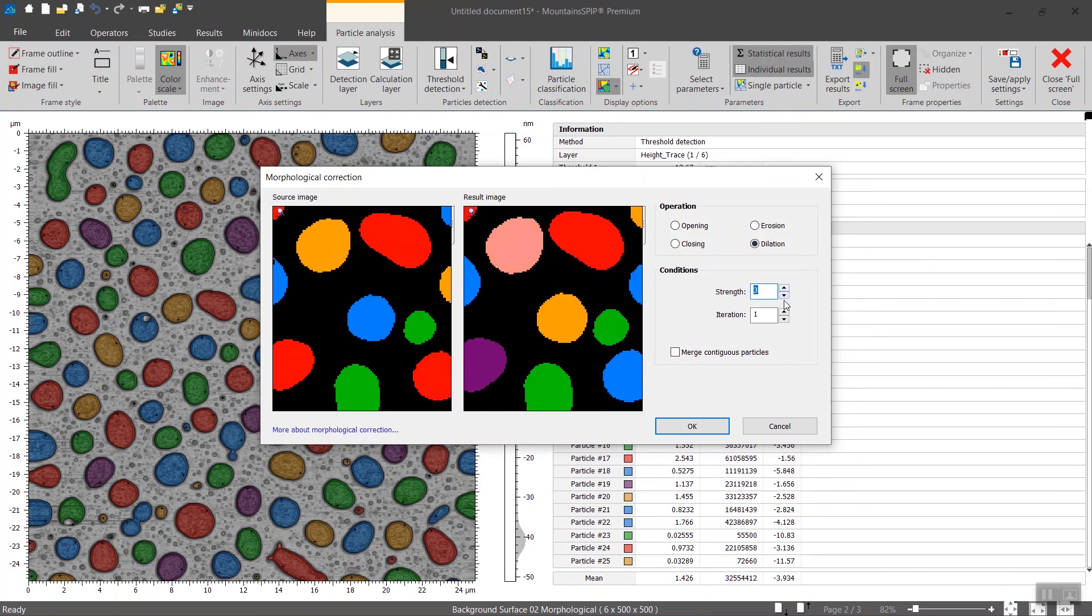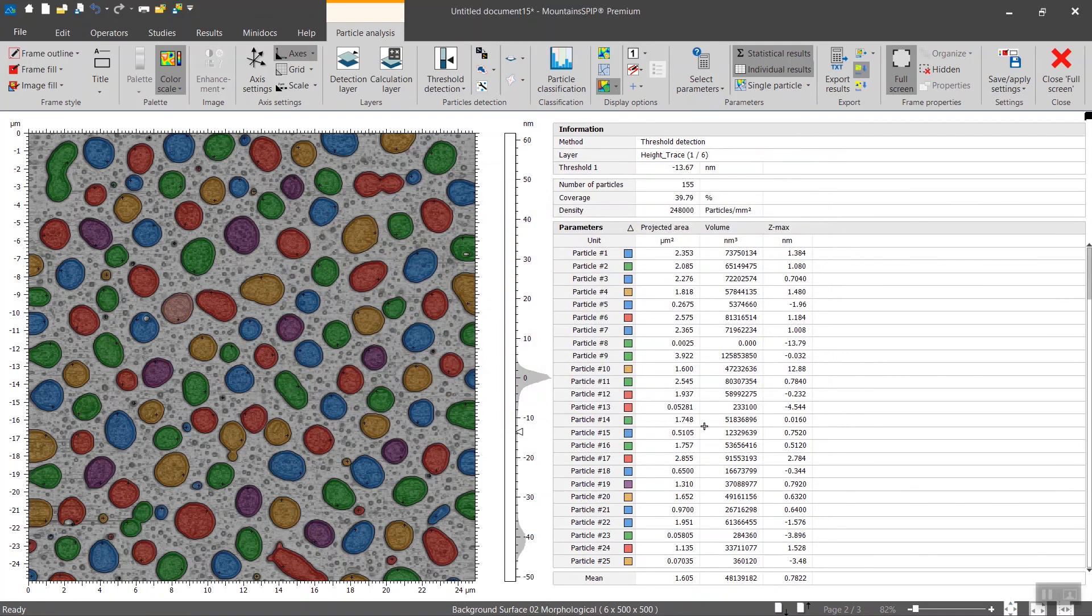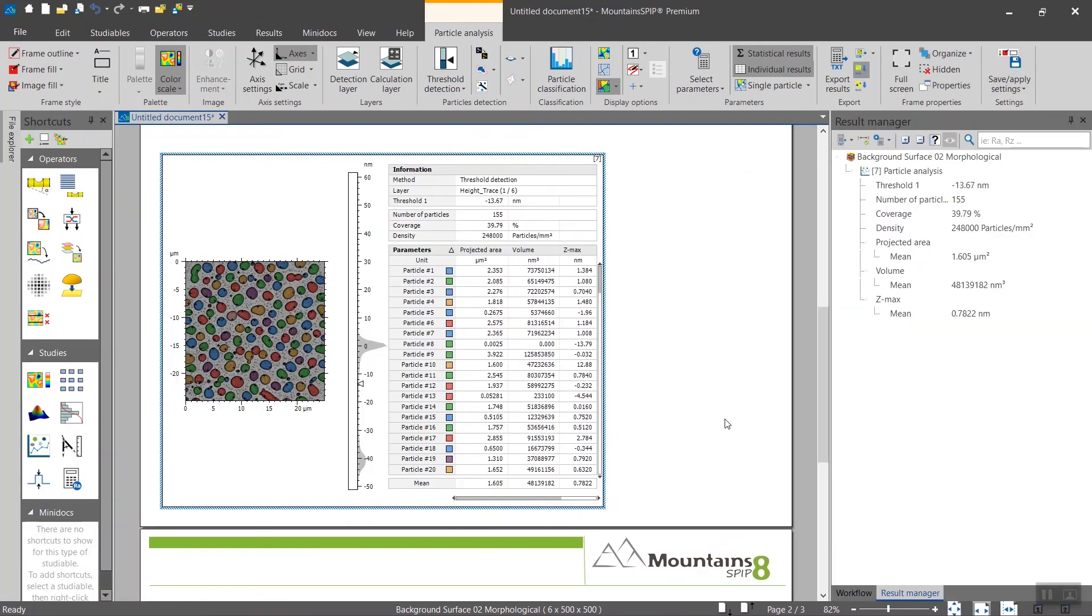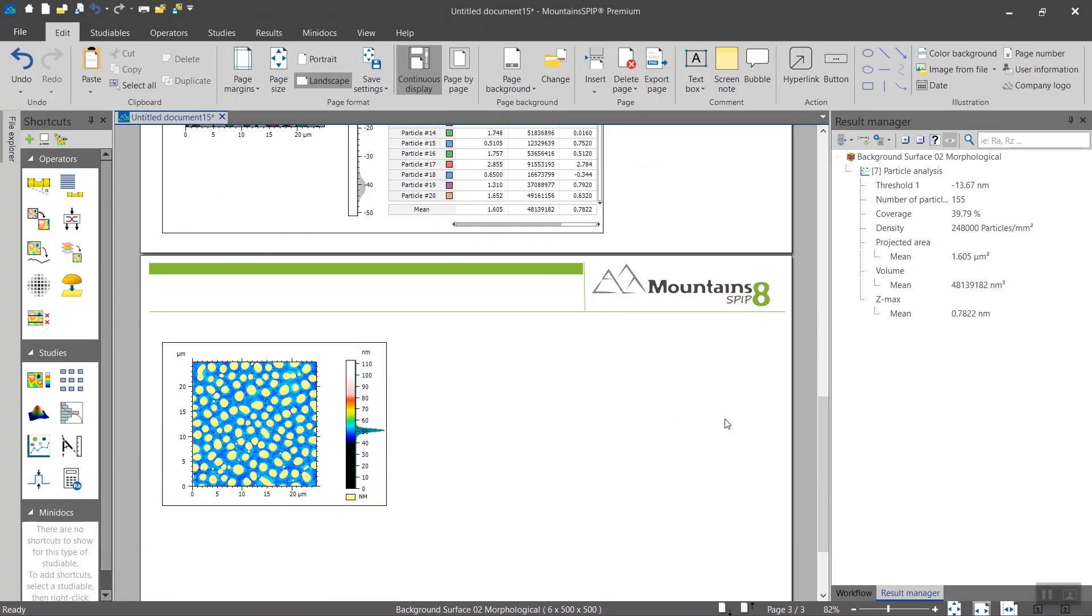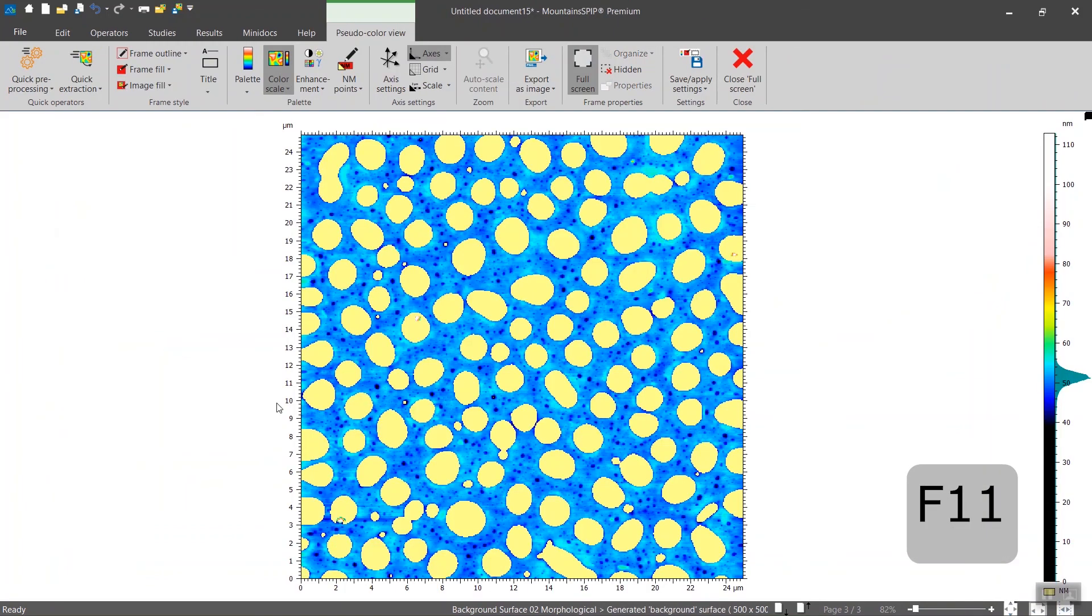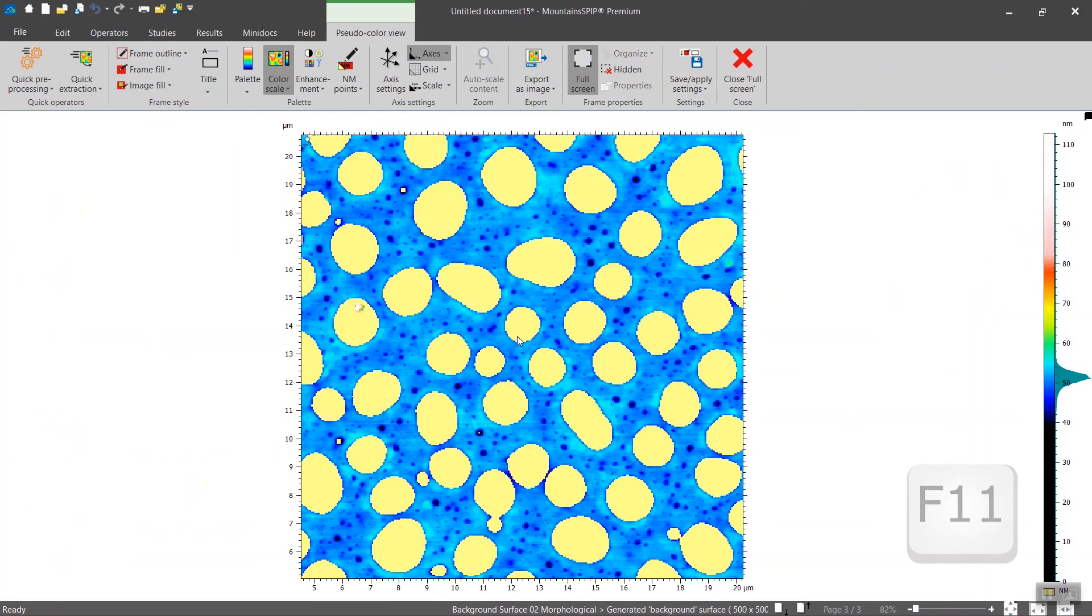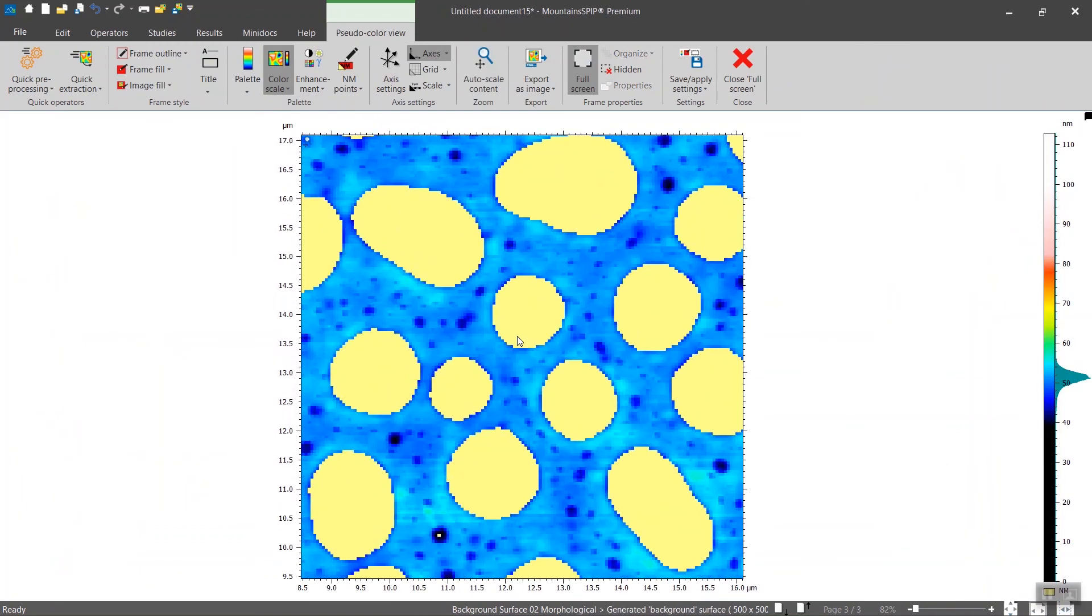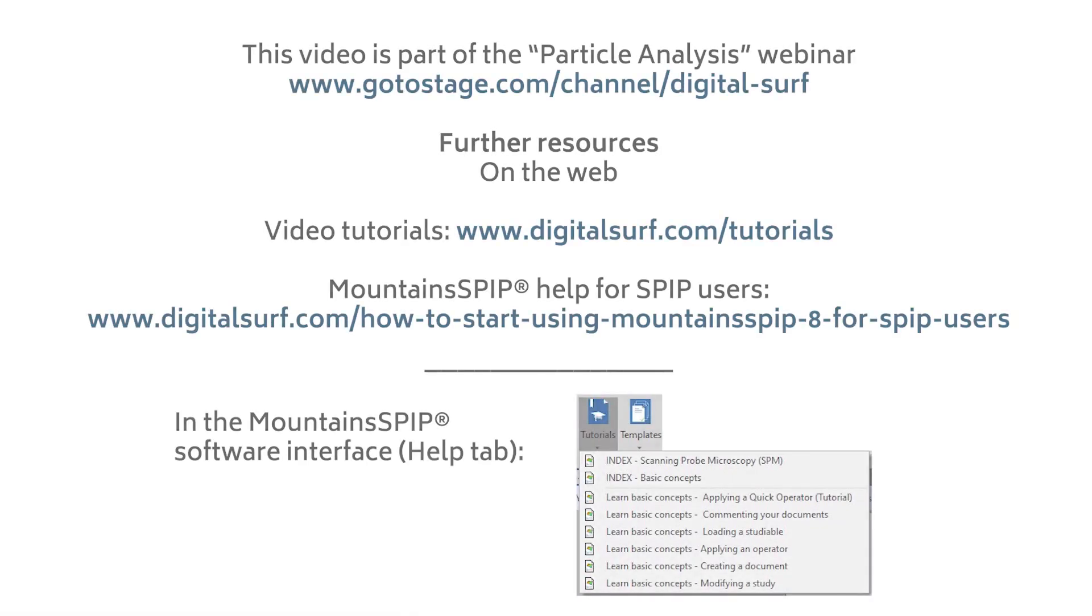And you will see the consequence on that surface. Okay.